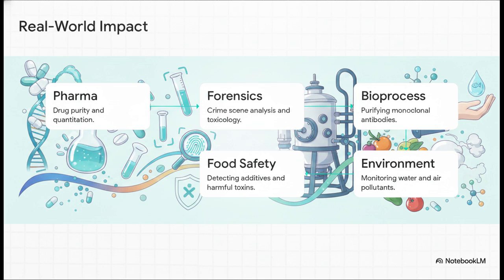I mean, chromatography isn't just some abstract lab exercise. It is quite literally how the pharmaceutical industry ensures the drugs you take are perfectly pure. It's absolutely essential in biomanufacturing for purifying complex, life-saving treatments like monoclonal antibodies. Environmental scientists rely on it to monitor hidden pollutants in our air and water, and it even ensures our food supply is safe by sniffing out harmful toxins and additives.